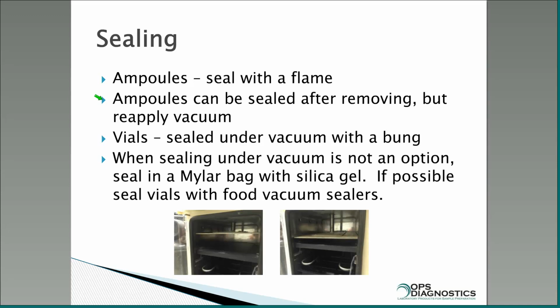That's good for liquids and ampules and that type of thing. So usually try to seal it while it's on the manifold with the vacuum. Vials you can seal with a bung under vacuum.